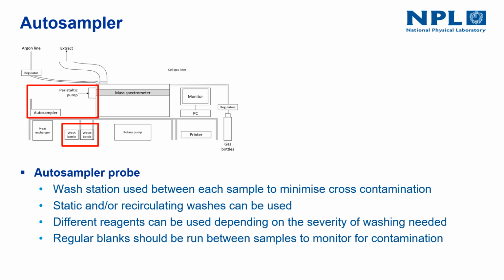Whereas after running tens or perhaps hundreds of samples, it might be that the wash time required to achieve the same level is on the order of 5 or 10 minutes perhaps, but either way it makes sure the instrument reaches that same point.